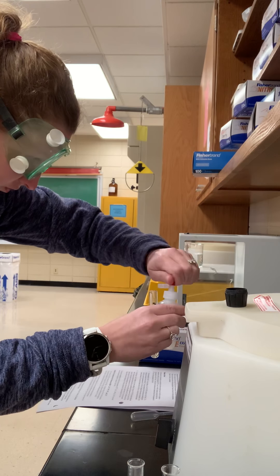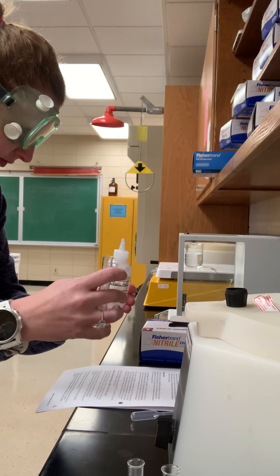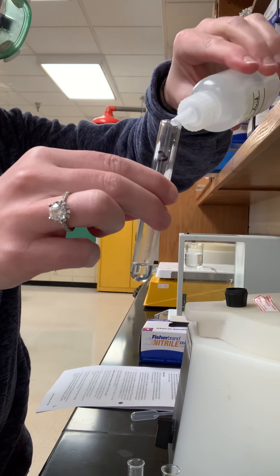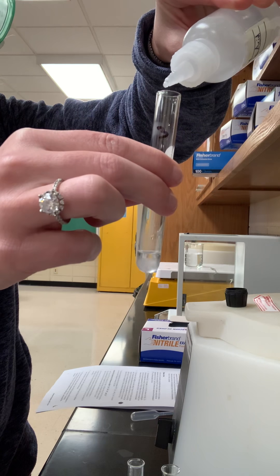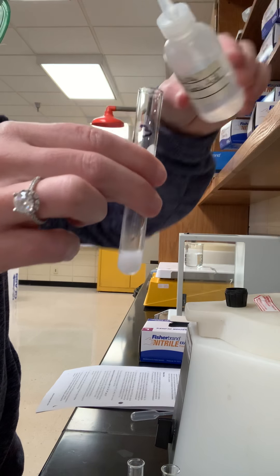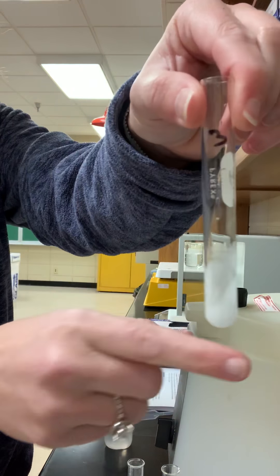Now add five drops of H2SO4. Here we go: one, two, three, four, five. Something happened — let's give that a good stir.